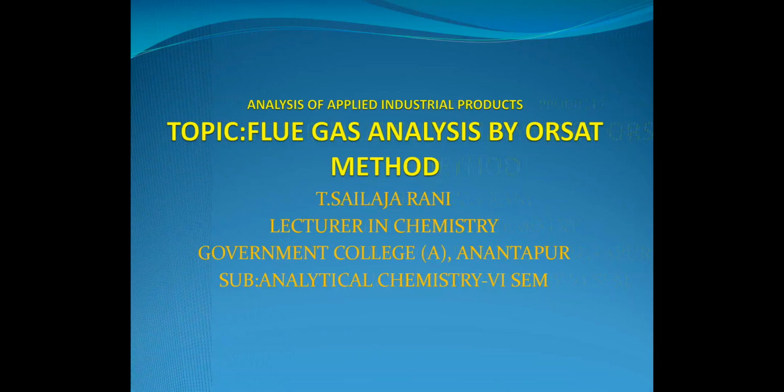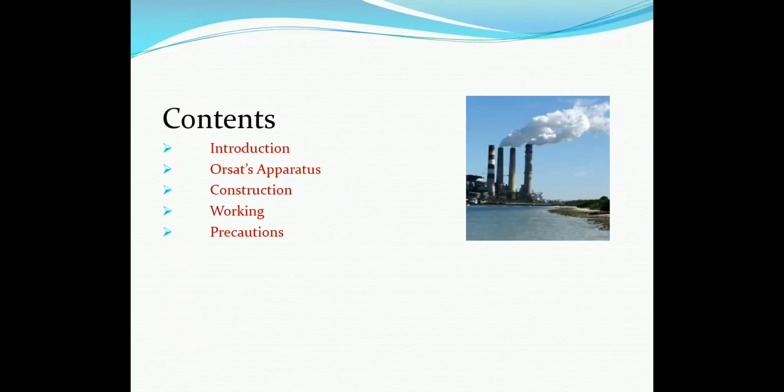Good morning, everybody. Today, I would like to discuss flue gas analysis by Orsat method. This topic is useful for BSc Analytical Chemistry students and also BSc Chemistry students of 6th semester of paper Analysis of Applied Industrial Products. The outline of this lecture contains introduction, Orsat's apparatus, construction, working, and precautions.